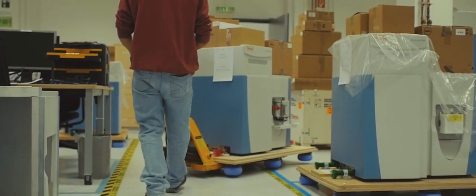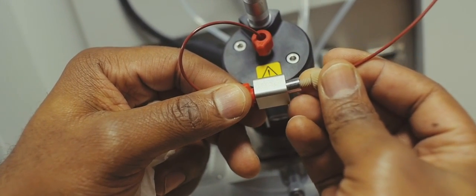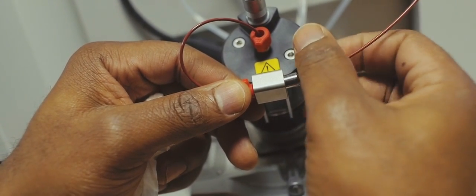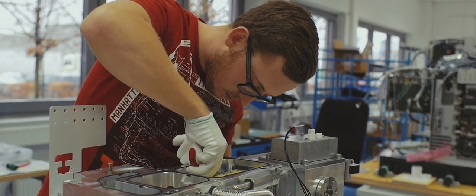Basically every unit of the instrument needs to be modified to fit the requirements of native MS. It's not only a higher mass-to-charge ratio, though this is the biggest parameter, but also the very important issue of solvation. I think the real advantage of Orbitrap technology and the way that engineering has been performed in the Exactive series instruments is that desolvation is being achieved very efficiently.